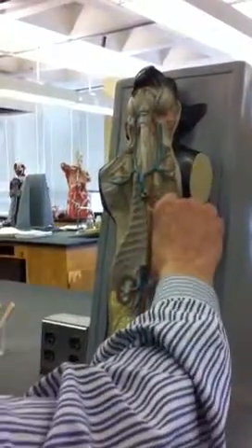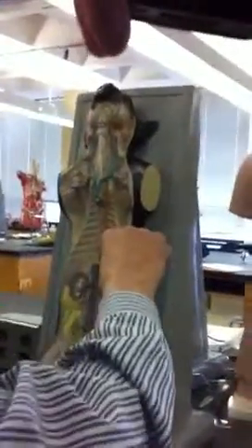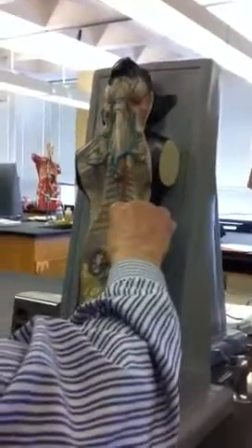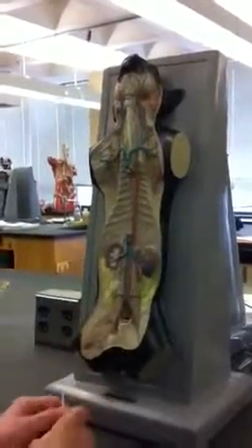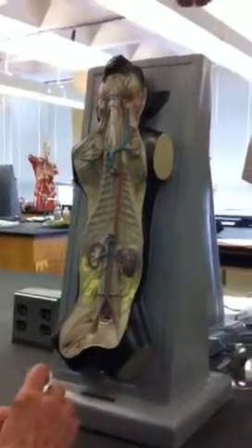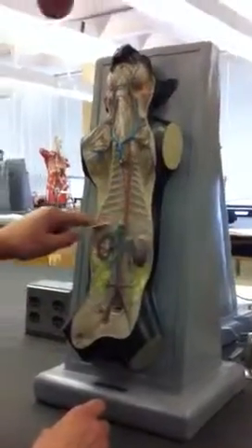So here is the thoracic aorta. Now here would be the diaphragm. There's no diaphragm here, but I'm giving you a general location, as it would be in us, after the thorax, separating the thoracic cavity from the abdominal cavity.